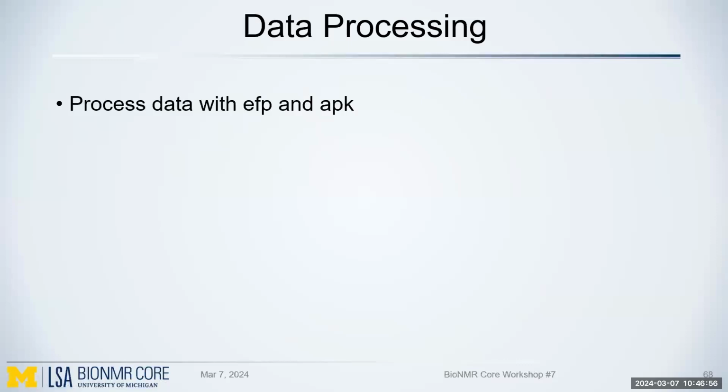Data processing for CPMG is very straightforward. Just start with EFP for Fourier transform and APK to automatically do phase correction.